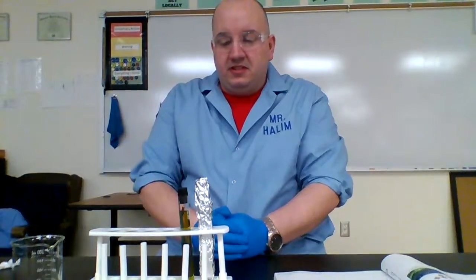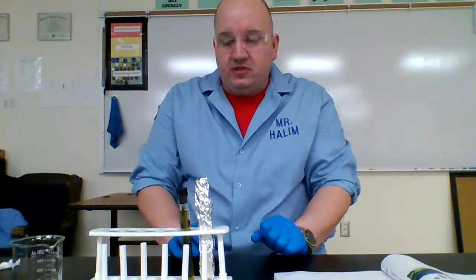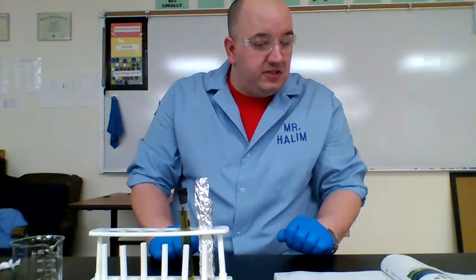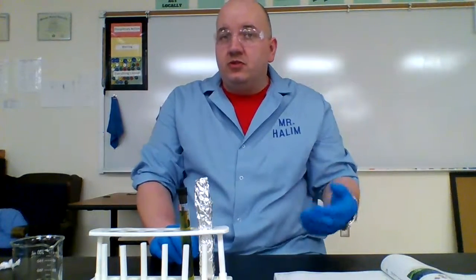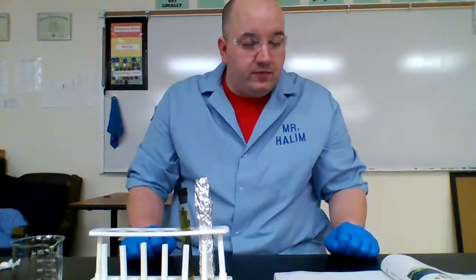So now this is what we're testing. You're going to make your hypothesis: which one is going to generate more oxygen over the next 24 hours. At this point, we are ready to answer step 6, where you describe the importance of having a tube that does not contain Elodea. That is your control. As a class, we'll just have one control bottle for you.